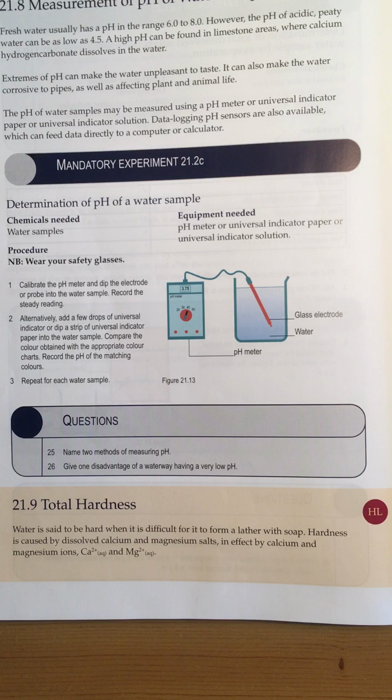Hi everyone. In this video we're going to talk about total hardness. There will be three parts. The first part we will discuss the theory of total hardness. The second part we will look at the titration, which is used to measure the total hardness in a water sample. And the third part of the video we will look at the calculation for that titration.